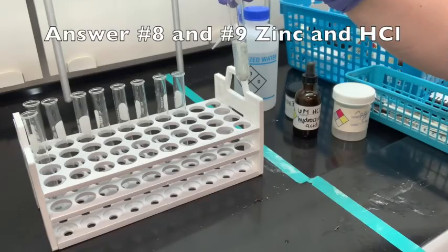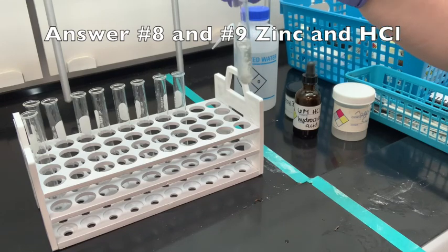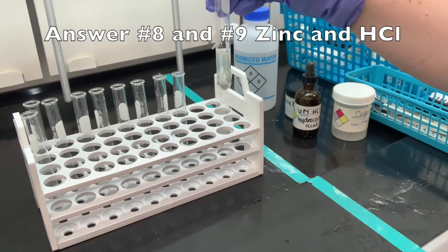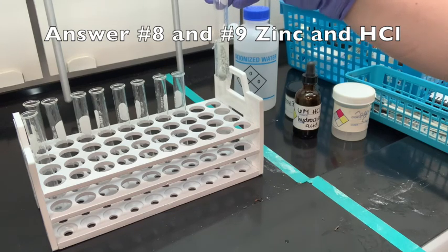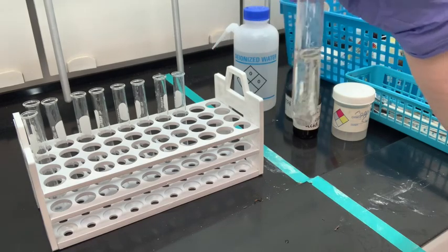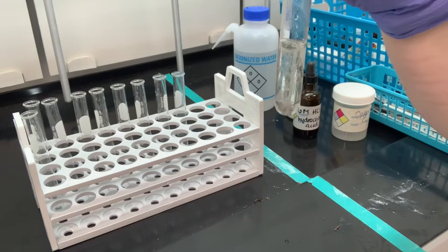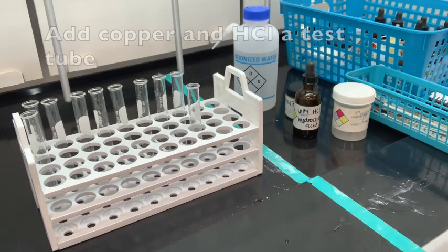Okay, so this is zinc and hydrochloric acid. You can see that it's bubbling here, so it is making that hydrogen gas. Reactive metals will react with acids to create a metal salt. In this case, that metal salt is going to be zinc chloride, ZnCl2, and it's liberating hydrogen gas. So those bubbles that you see are hydrogen gas being released. Okay, so this is an active metal. It's definitely active. It's definitely reacting in there.